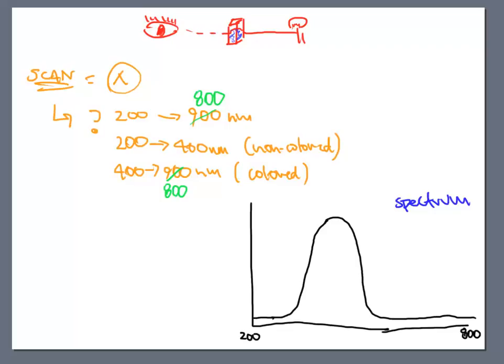Numerous different items that they really, really enjoy, but they always have a favorite. So some of these spectrums can be a little more complicated than others. But this is what we would call a spectrum. And the purpose of the spectrum is to give me the favorite. Where in this range did the molecule really respond to the light energy that I'm giving it?